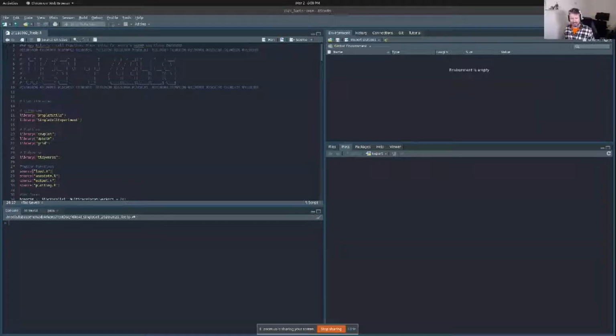Luckily, Henry did an amazing job in the last 2 weeks explaining how all of the math works, so I don't have to. I can just run those quick lines of code, and you guys already know exactly what's happening in the background. I will explain things as we go, and might move a little quick, but I'll stop to talk about the stuff as some of it takes time to process.